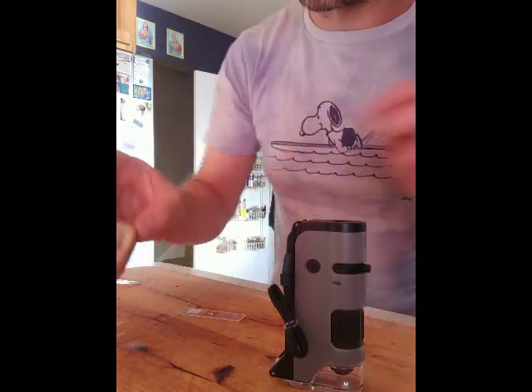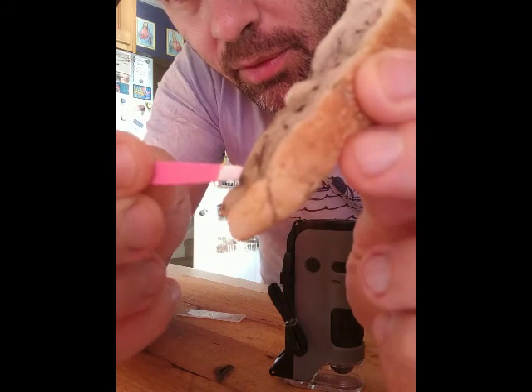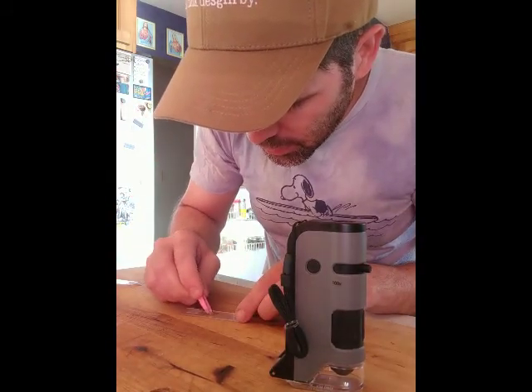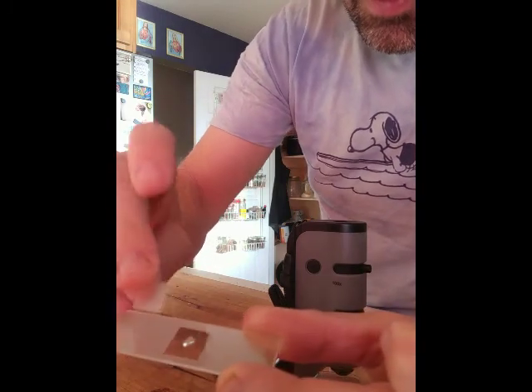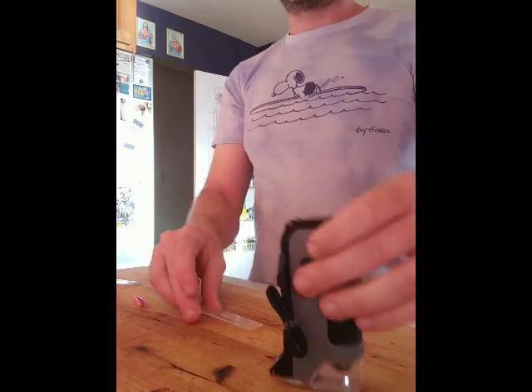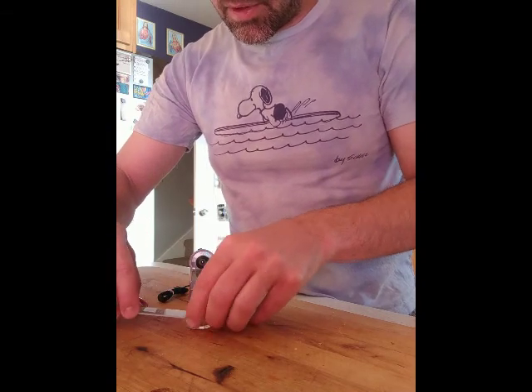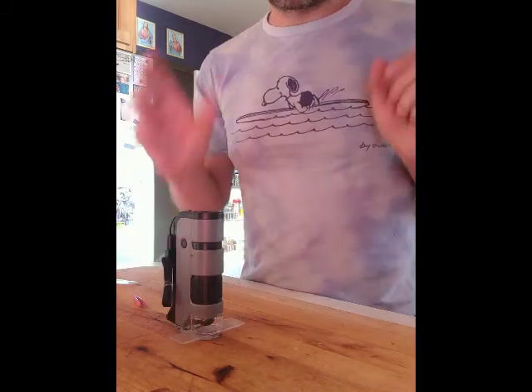Next up we're gonna go into our moldy bread and try to find some fungal hyphae. We're going in with our tweezers and pulling out the bits of fuzz that are sticking off the edge. Set that down on your slide, put your cover slip on, and give it a little bit of a smash.